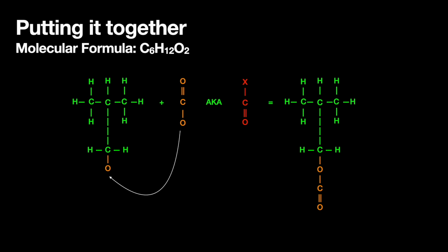Here, we can see that both the carbon-13 results and the hydrogen-1 results reported on this structure. The carbon-13 was able to give us a tiny bit more data, that there is a single bonded oxygen on the carbonyl carbon, making this an ester. Using the X as a placeholder again, we tack on the carbonyl group.